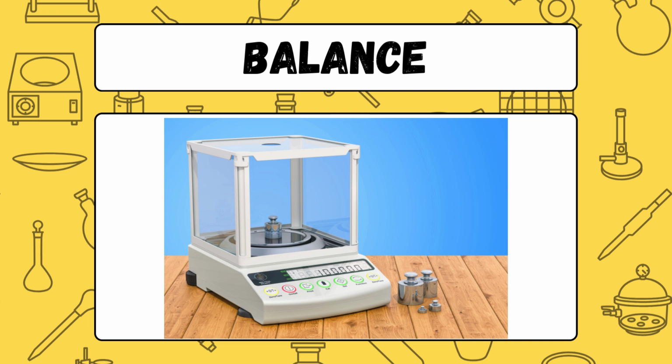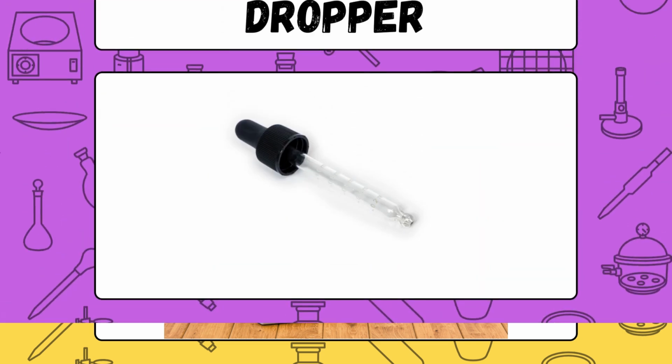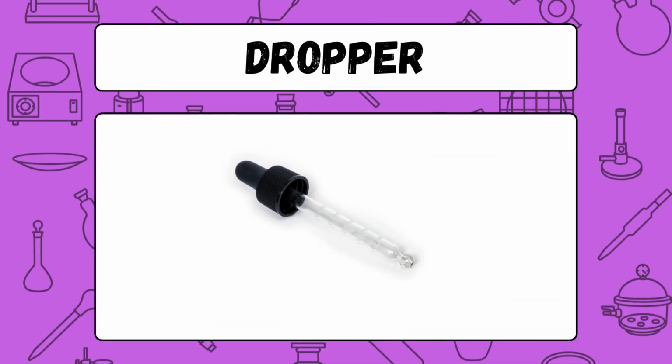Balance. A balance is an instrument used to measure the mass of objects. Dropper. A dropper is a small, glass or plastic tool used to dispense liquids in drops.